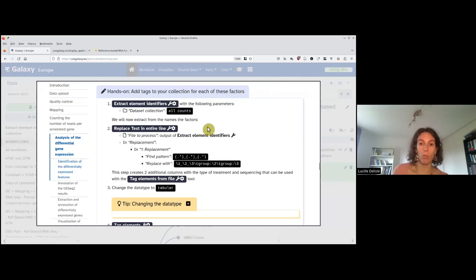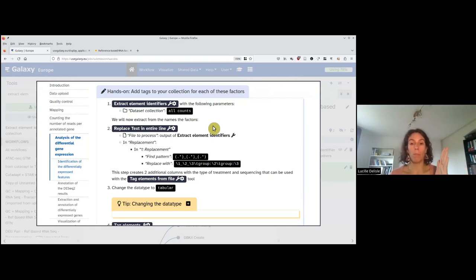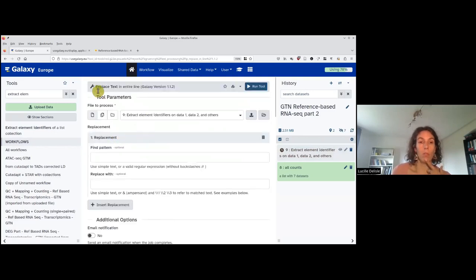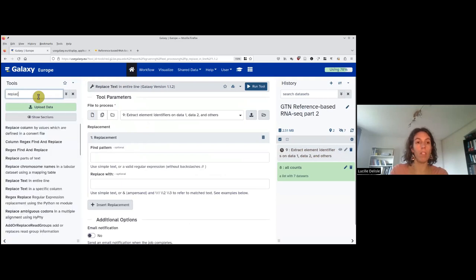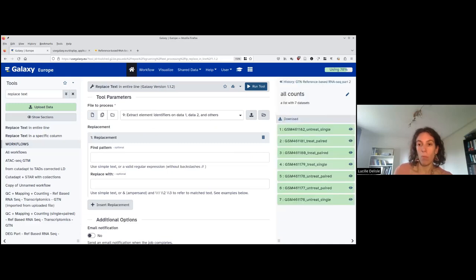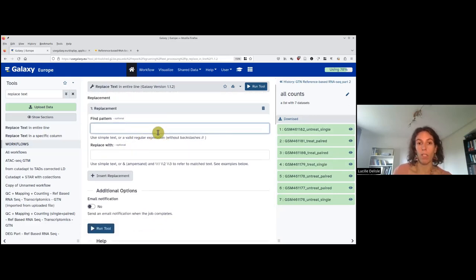Then we will generate a new tabular file where we put the name of the identifiers followed by different columns indicating the group they belong to. We use the tool called 'replace text in entire line,' and apply it to the extract element identifiers output. What we have in the text file is something like 'gsm_blahblah_untreated_single,' and here we do what we call a regular expression. We capture what is before an underscore, between underscores, and at the end — dot means any character, star means as many as needed.